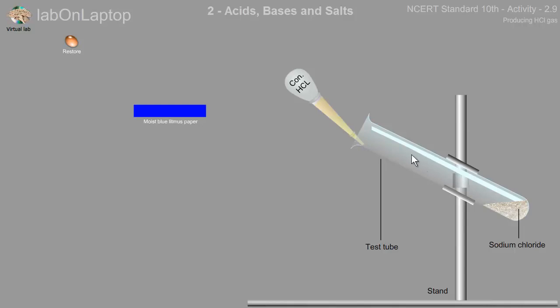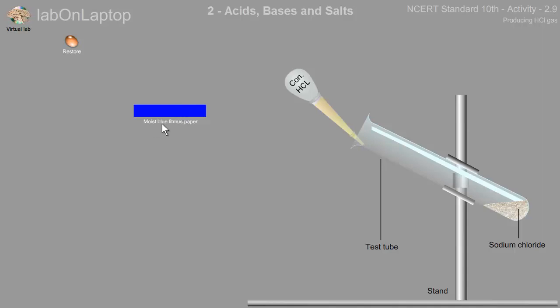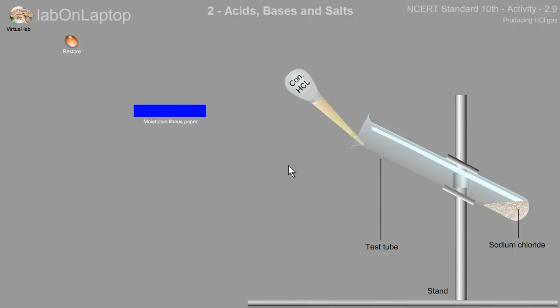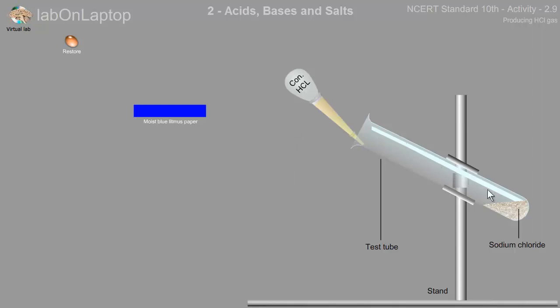This is an experiment that we can understand. The most important portion of this activity is you have to click on the dropper and add concentrated hydrochloric acid to the test tube.